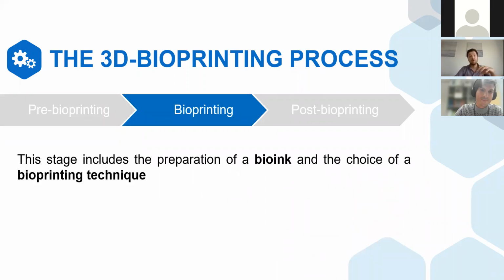When we talk about the bioprinting process itself, and I know this is what matters the most to most people, this stage is very important, of course, and also includes something that is very forgotten or not talked about, which includes the preparation of the bioink or the choosing of the bioink and the choice of an appropriate or a suitable bioprinting technique.